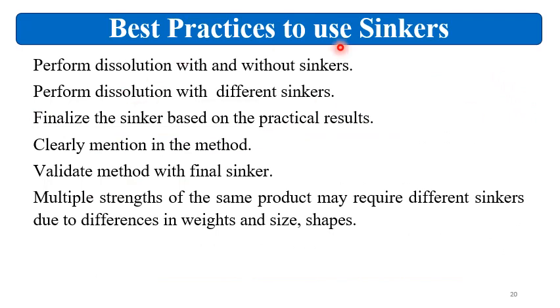Then some best practices are there. Perform dissolution with and without sinkers. If you want to justify the use of a sinker, take the same formulation batch and test it on dissolution with the sinker and without the sinker, and compare the results. Then perform dissolution with different sinkers. If your formulation permits the use of different sinkers, then always check the impact of the sinkers on the dissolution. Then finalize the sinker based on the practical results.